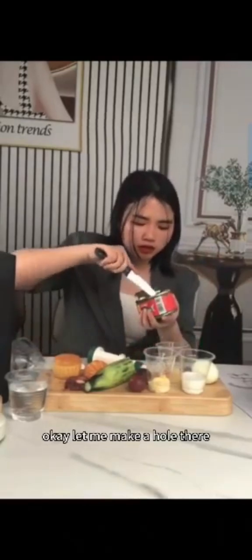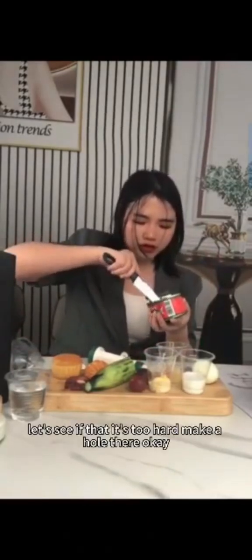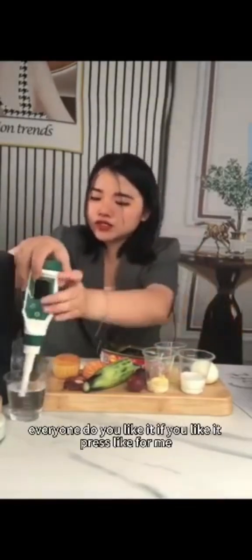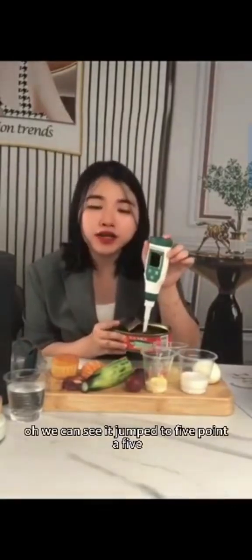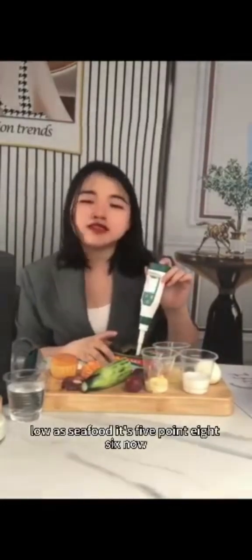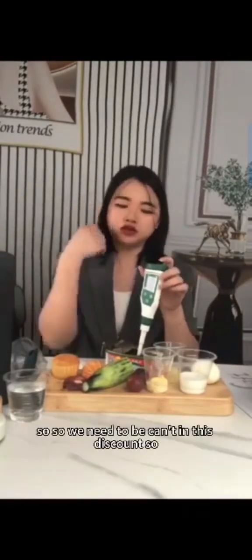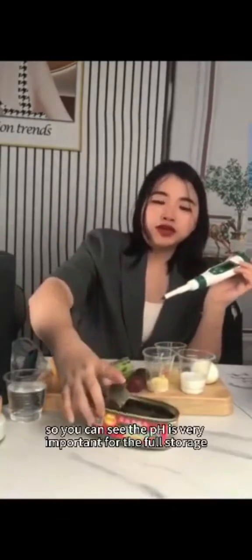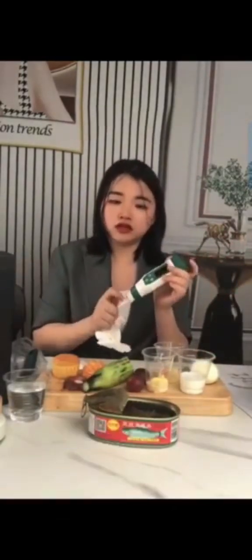Let's test the pH of this canned fish. Let me make a hole there to insert the probe. You can see it jumped to 5.85 — now 5.86 — so it's a low acid food. That's why it needs to be stored in a can. You can see how important pH is for food storage.